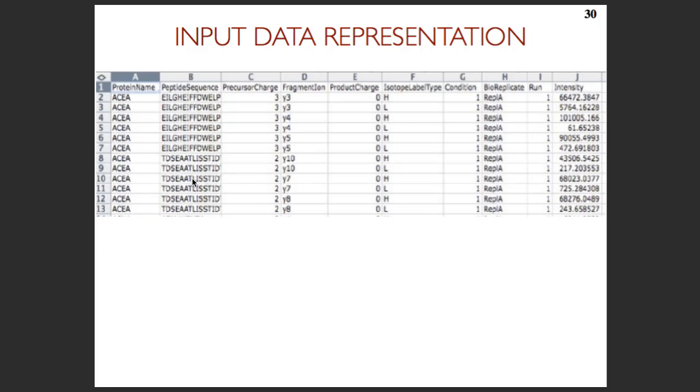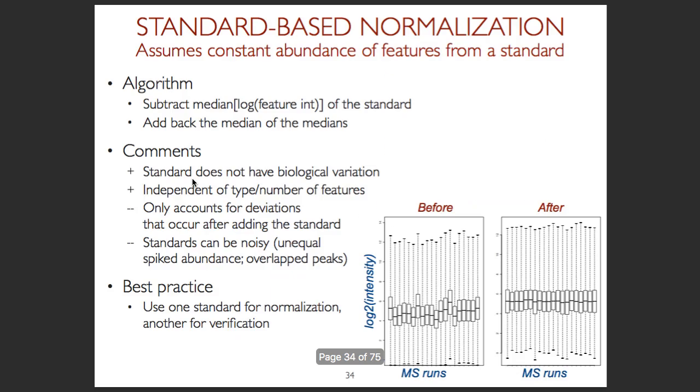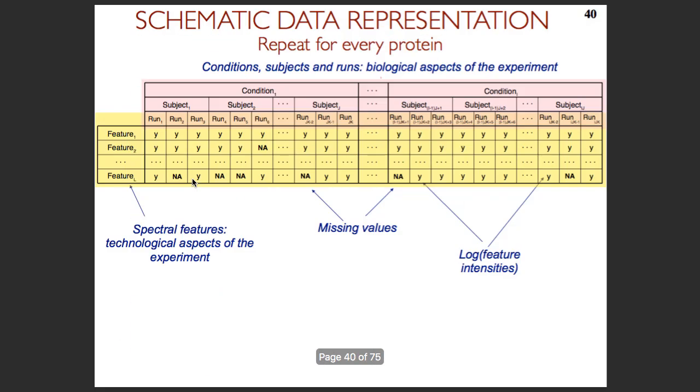As we mentioned last week, doing peptide level quantification is nice because peptides may not agree with each other for quantification for good reasons, such as PTM. It is bad because suddenly our space of analytes increases dramatically, right? It increases multiple testing and so on. So only do it if it's absolutely necessary, right? But in MSstats, we can do it. In this case, this will be multiple features of a peptide. But for our purposes today, let's talk about protein quantification, where we're interested in integrating all the information across peptides and fragments to make protein-level conclusions.